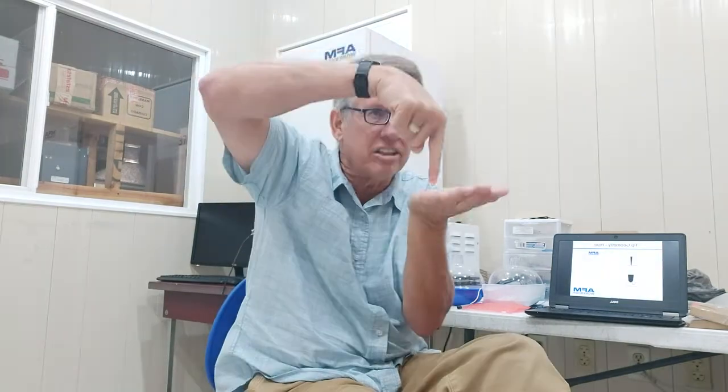But in AFM, there really is no definition for resolution. I have a write-up about this on our website, because the resolution in the vertical dimension can be 20 picometers. That's this dimension. But if the diameter of the probe is a micron, the resolution in this direction is a micron. So what's the resolution? A micron. It depends on what you want to look at. We get this a lot from people that are very new to the field: what's the resolution of the microscope? And the problem is this, and we talked about this yesterday.